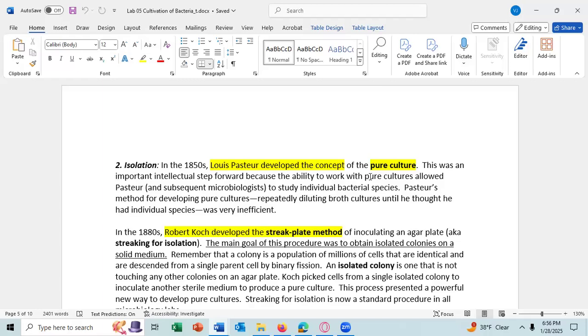It's not 100%, but 95% or higher is good enough in microbiology, and this is the procedure we use to obtain a pure culture. You need to streak it out for colony isolation, streak those cells out 2 times, going through 2 separate isolated colonies. And then you can say with 95% certainty or higher that you have a pure culture.